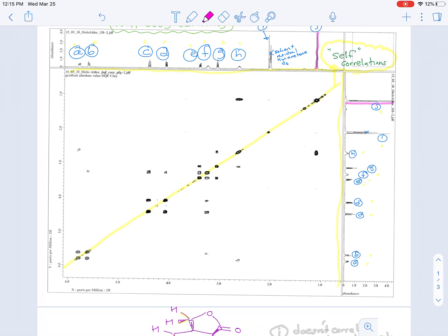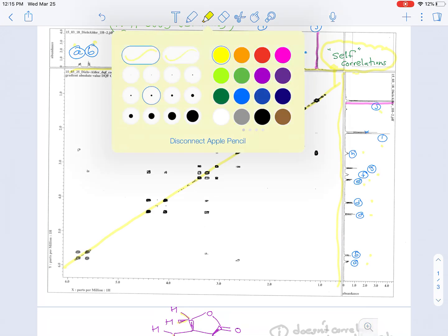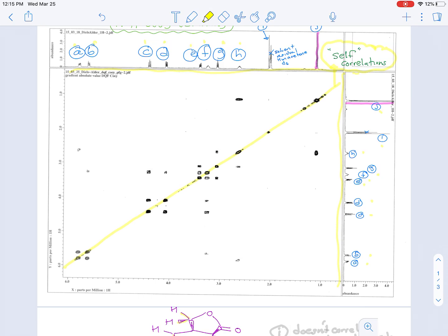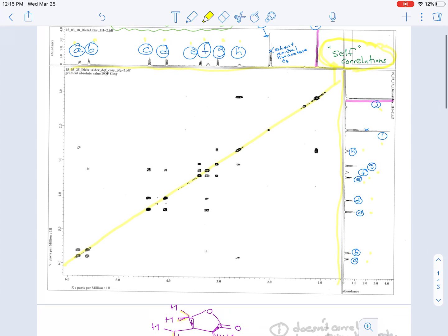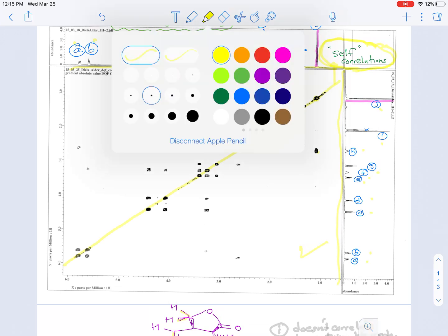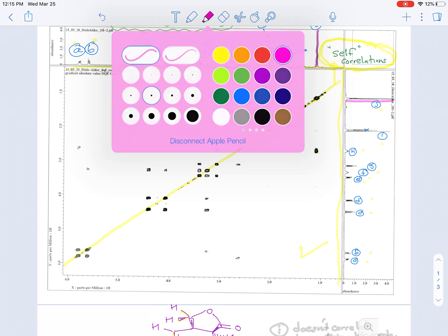So looking at the COSY, I've already highlighted in yellow what I refer to as the self-correlations. So those are signals where the signal correlates to itself. So that would be there for signal J. And I've drawn this nice diagonal line. And it turns out that there are a couple of approaches to this. You can either use the signals above the diagonal line or below the diagonal line.